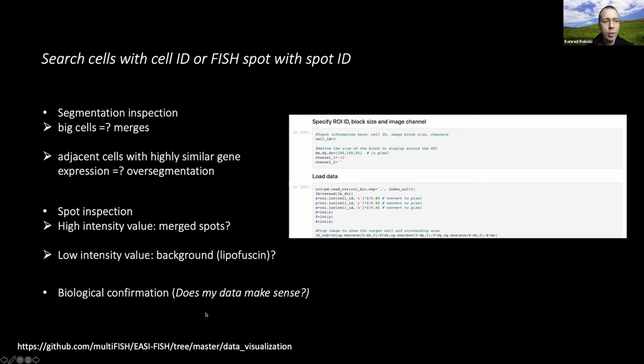Yeah. Yuhan, just a quick question. For these analyses, how interactive is it? Do you need to be there inspecting it, or is there any part of this that could be automated, like you could just take this code and put it into the pipeline? Well, yeah, that's a good question.